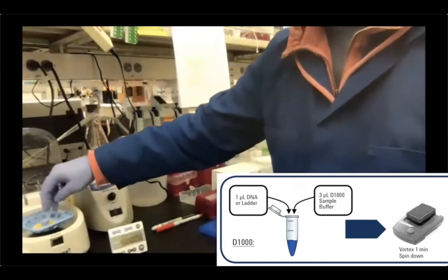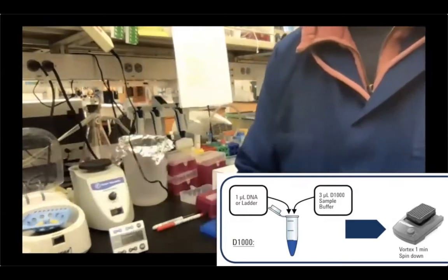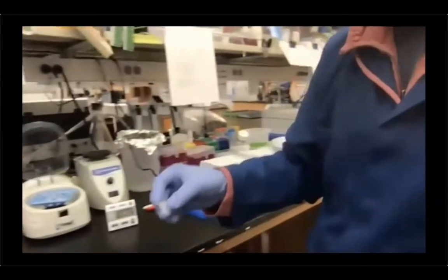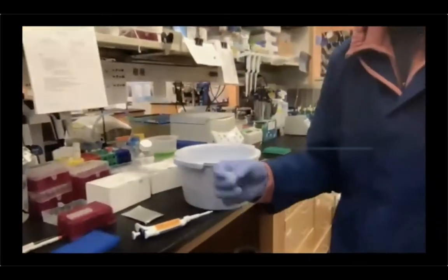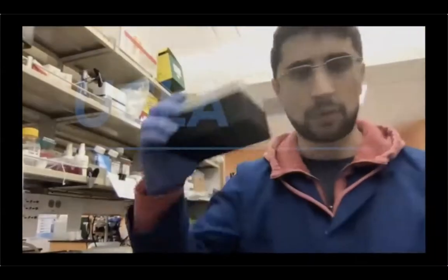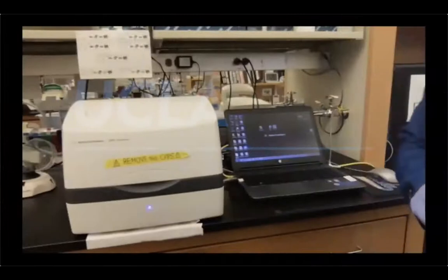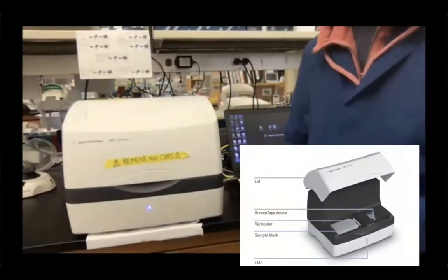This time, differently from the RNA, there is no incubation step, no ice incubation. So we're basically ready to go with our samples, our tips, and our tape. All right. Okay, so here we are on the other side next to the TapeStation.